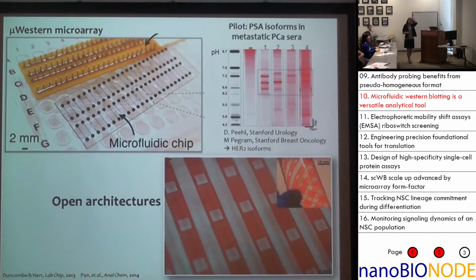I will mention, students, these glass micro devices, they're actually quite expensive. They're difficult to make. We can reuse them. We've developed protocols to do that. But I think a couple of my grad students were just sick of spending time in the clean room, if you can believe it. And they decided, you know what, let's forget the channels in these glass devices altogether, and let's just take polymers and pattern them on flexible materials. So instead of creating the polyacrylamide gels inside the microchannels, the size of the human hair, let's just pattern them on top. So there's no walls at all, right?